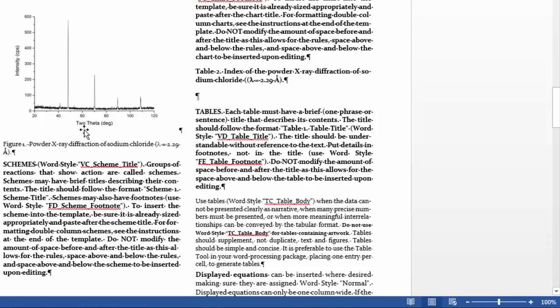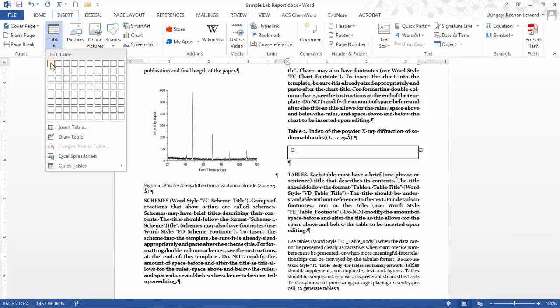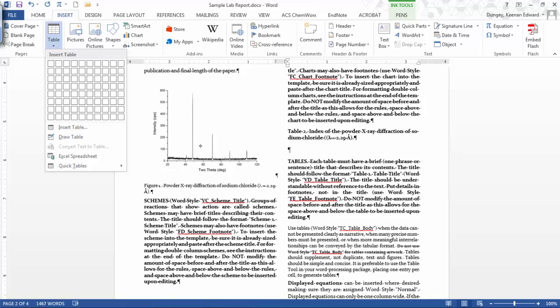We need the 2-theta data tabulated. How many columns? 2-theta, theta, the K factor, the sine squared factor, h squared plus k squared plus l squared, and then the hkl. Okay, and a, if we do that. And we have 1, 2, 3, 4, 5 peaks, it looks like.